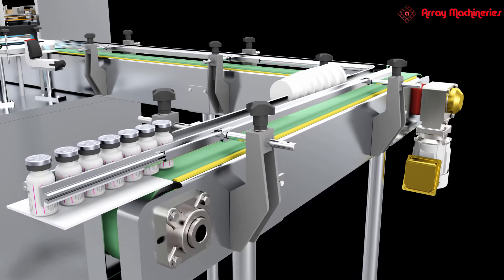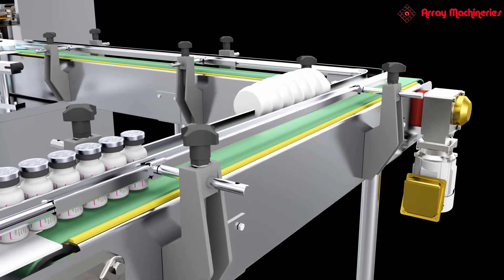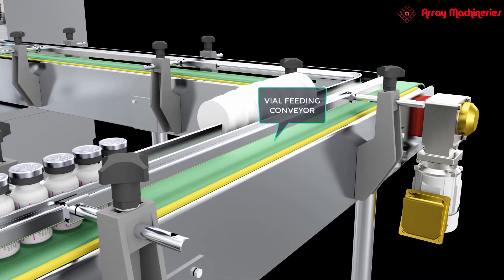Array Machineries deals in the field of packaging and filling machines. At first, vials get fed through a vial feeding conveyor.